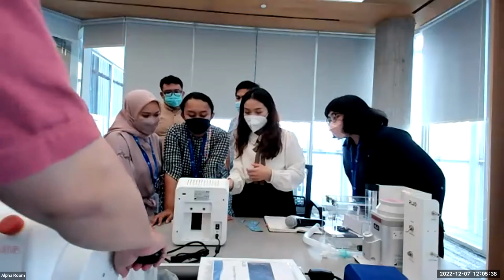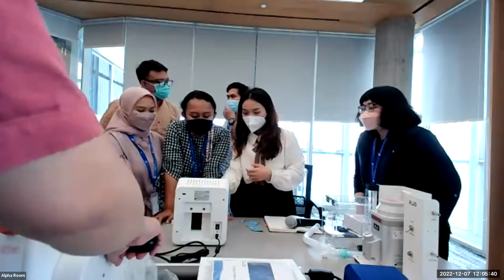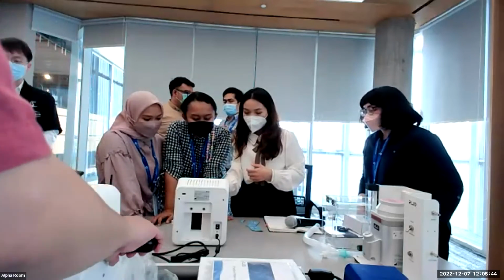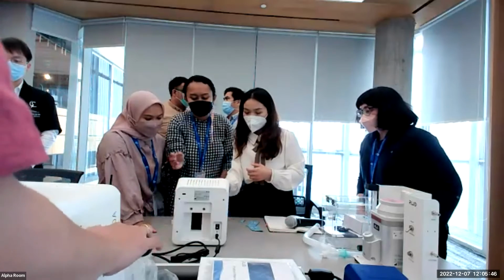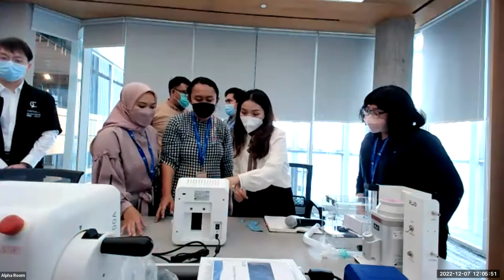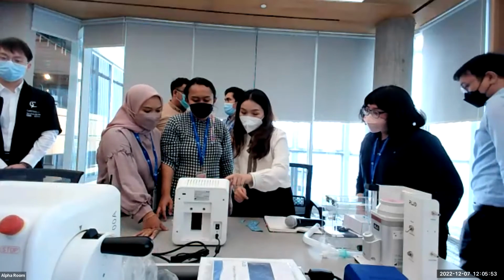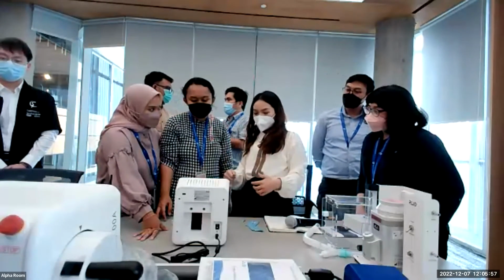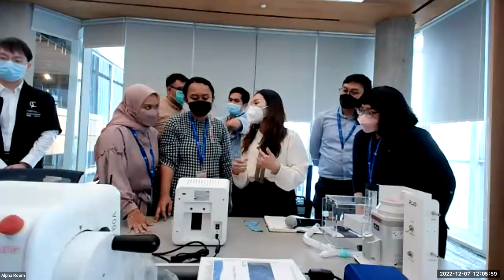Oh, lucu ya. Bagus ya. Geser kan biasanya nih kita ngegeser-geser ininya. Nah ini ngegesernya pakai apa? Dari layar. Yeah, if you choose this one, you will get the clear image without any operation.